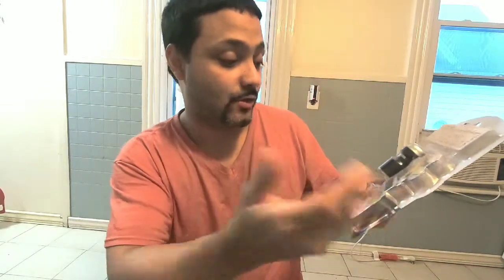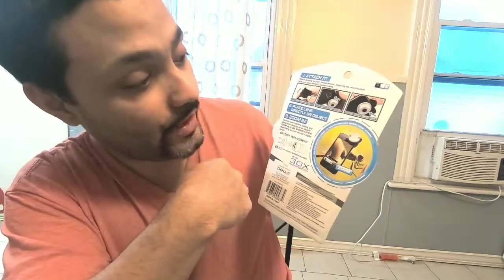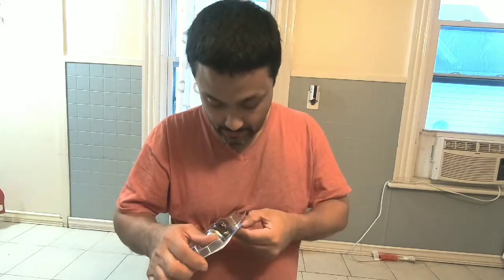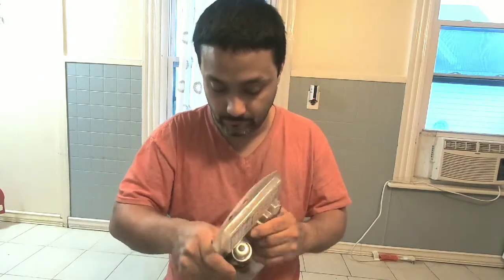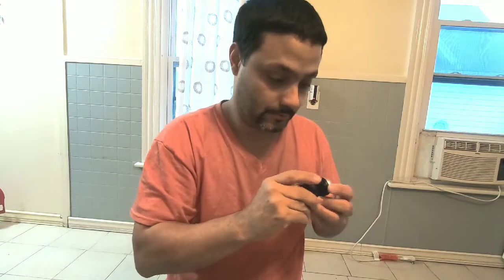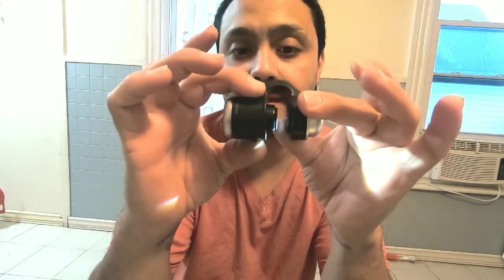It goes up to 30x — that is your phone — and as you can see you can see the wings of the fly. You just connect it, so let's get it open. Just like that, you have a light so you can see a little better.